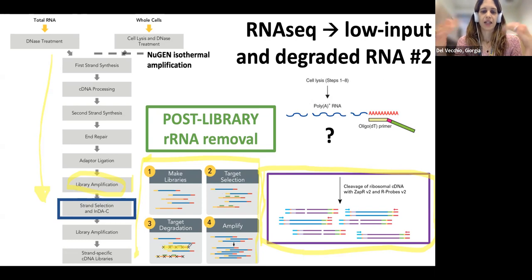And again, as we discussed before, I'm talking about ribosomal, but it can be a mixture of whatever you want. So it can be ribosomal plus tRNA. So you can customize the removal part. Let's just say that you can remove the unwanted transcripts.